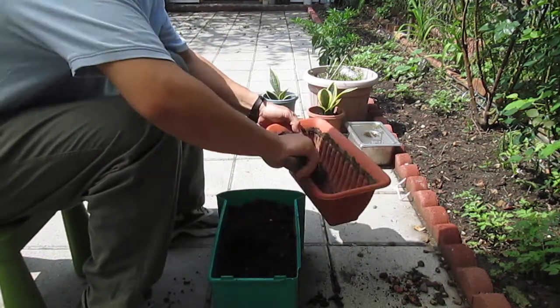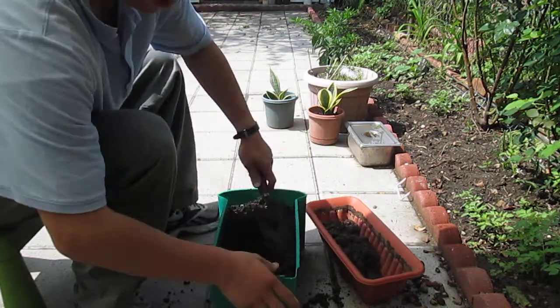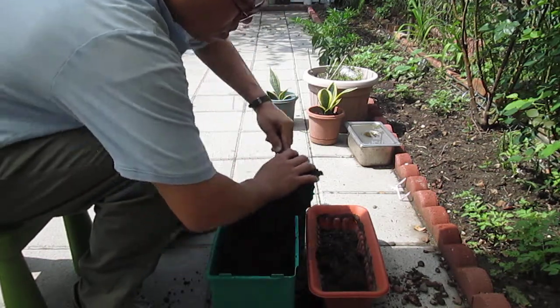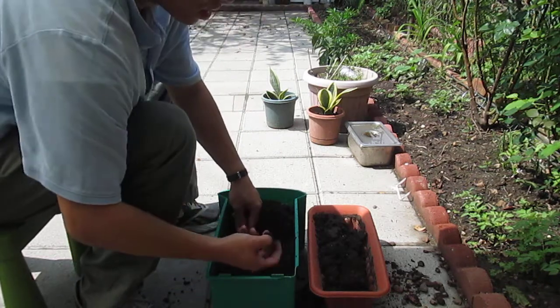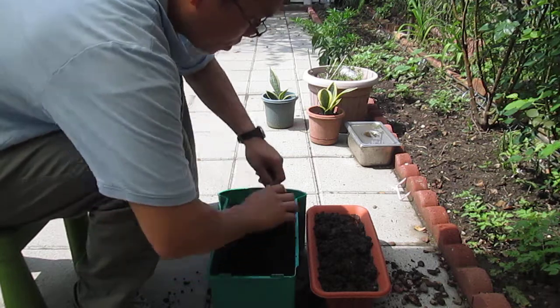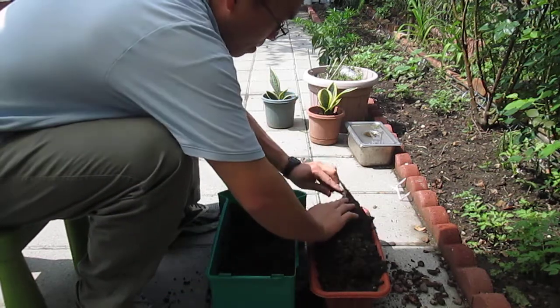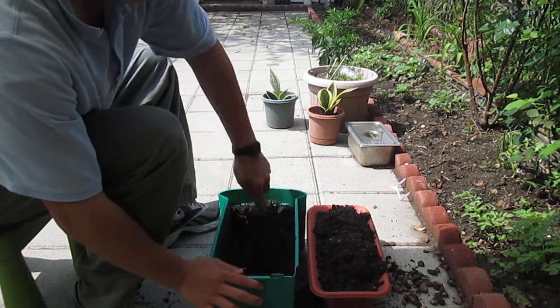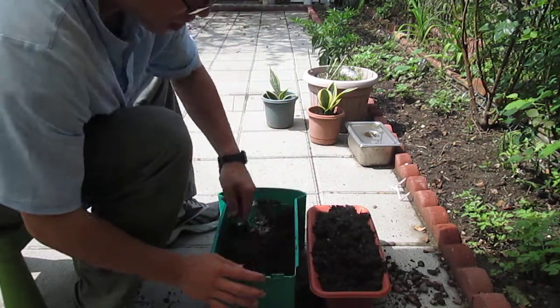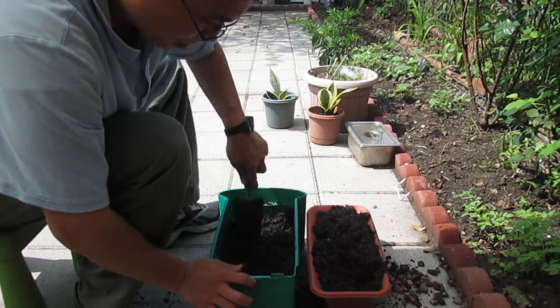Save some soil for later use. Today's date is May 17th. The objective of this experiment is to see if the biodegradable film is really biodegradable in the soil.